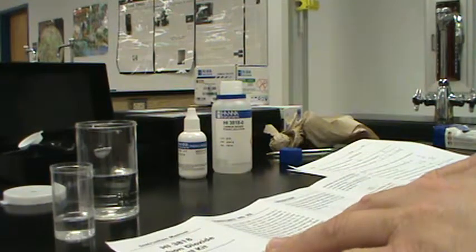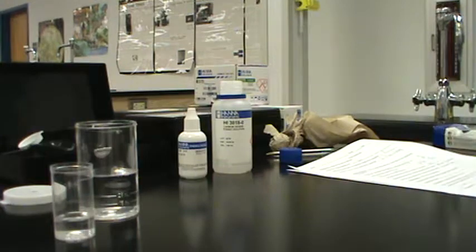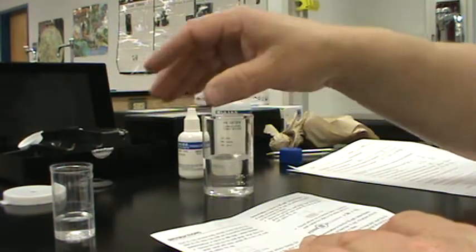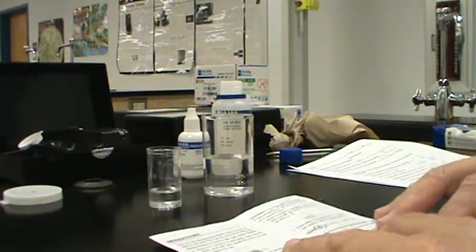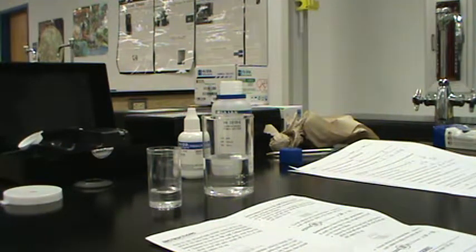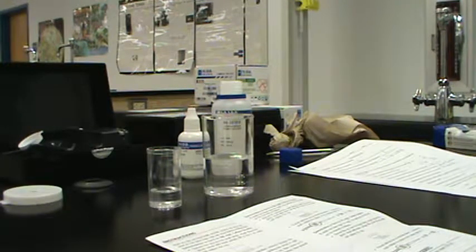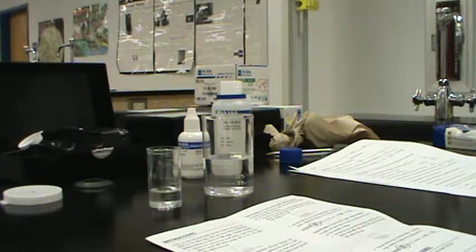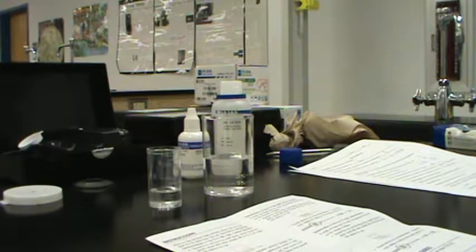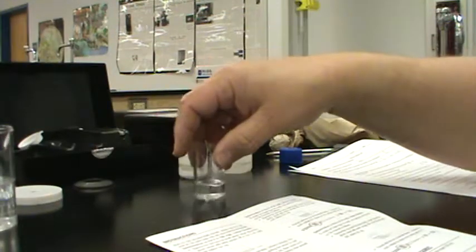Carbon dioxide levels can be measured quickly and safely using this kit. We've got two tests — a high range and a low range. We're going to start with the smaller one first, and for this one we are going to determine if we're in the 0 to 100 milligrams per liter of carbon dioxide using the small indicator vessels. So we're going to start with this one.